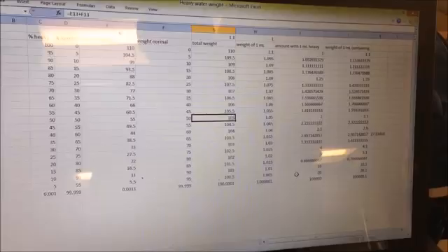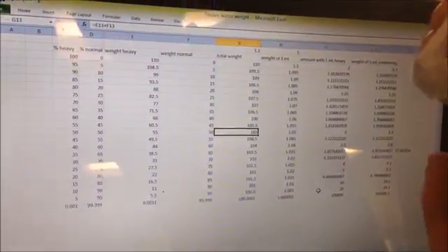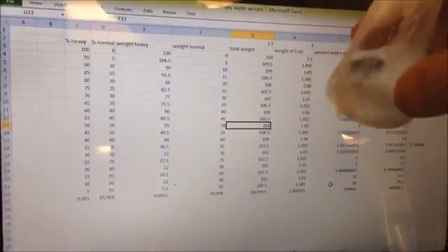Basically, precision here is between twenty and thirty percent deuterated, which means it contains probably about - yeah, we figured the maximum it contains is two point four grams of heavy water inside this sample.